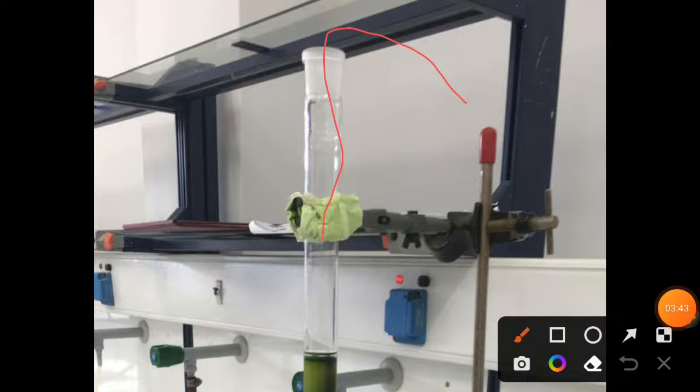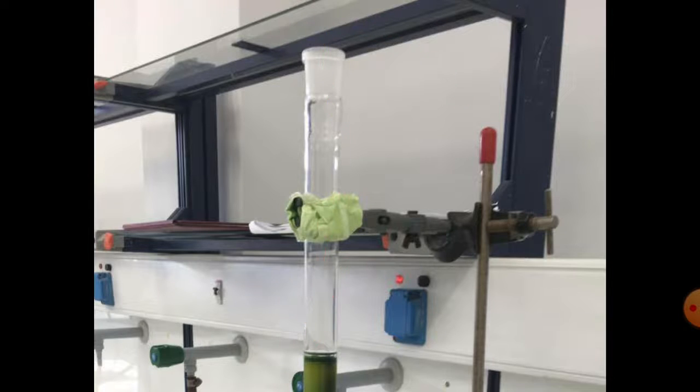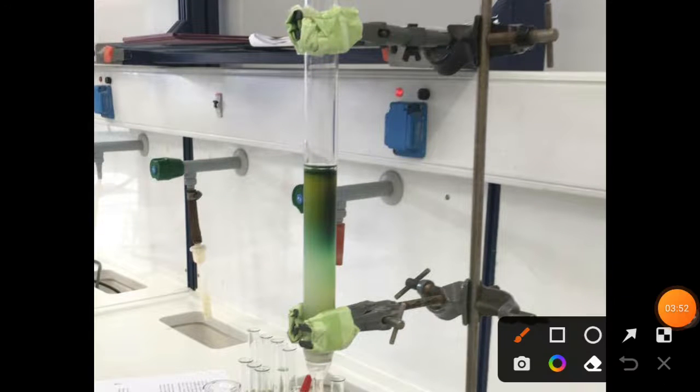add our mobile phase. After that the mobile phase will be layered on the top of the solid phase and eventually percolates through the solid phase as an ever expanding band, and that's how separation goes on. And here, will larger molecules separate faster or slower? Think about that.